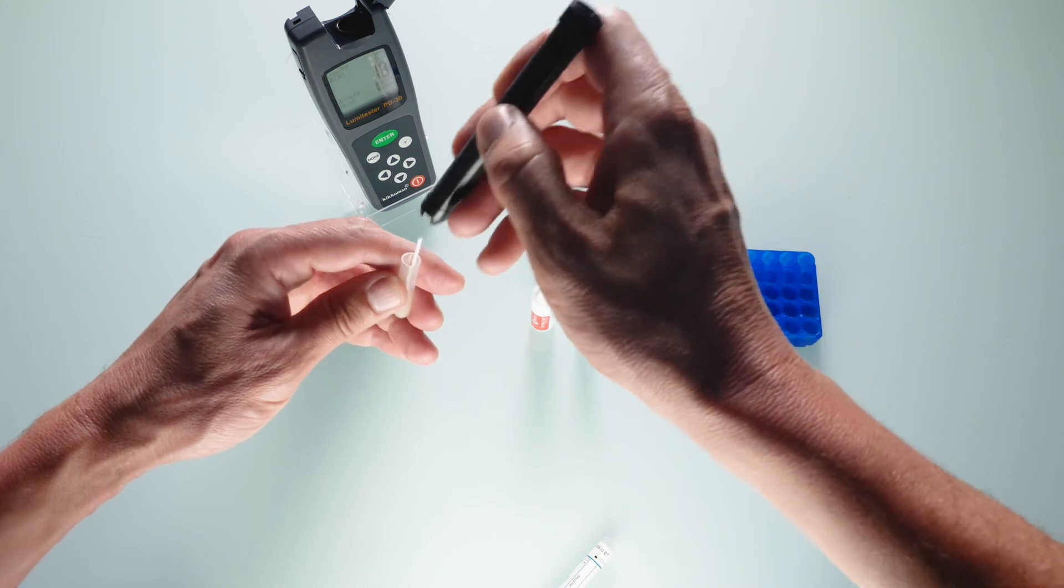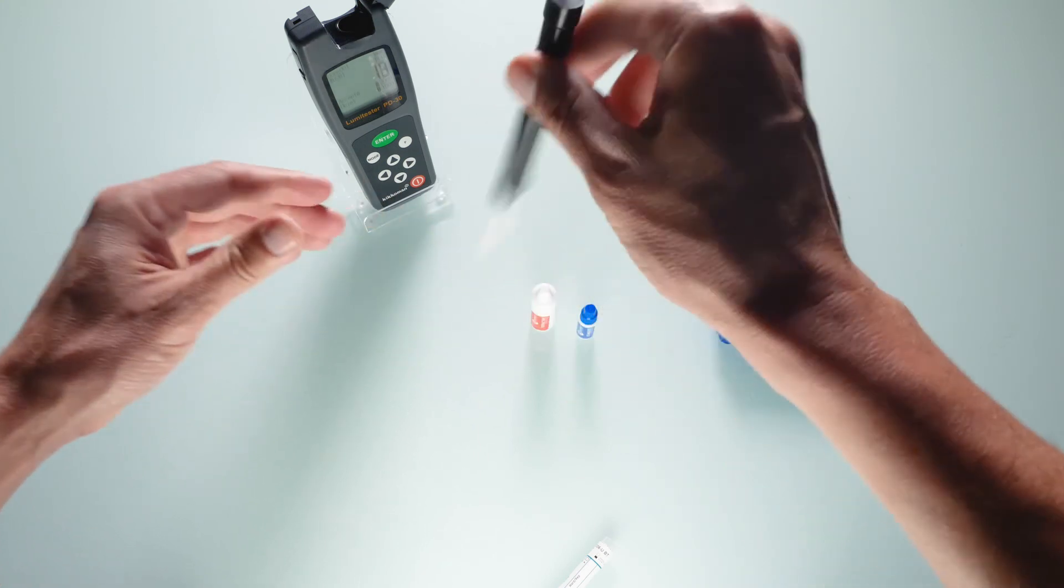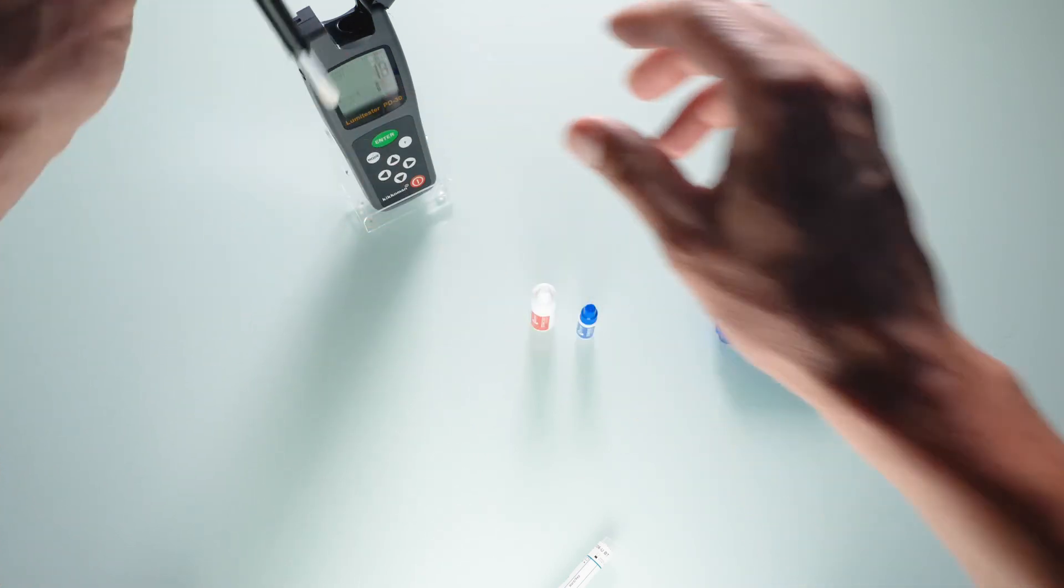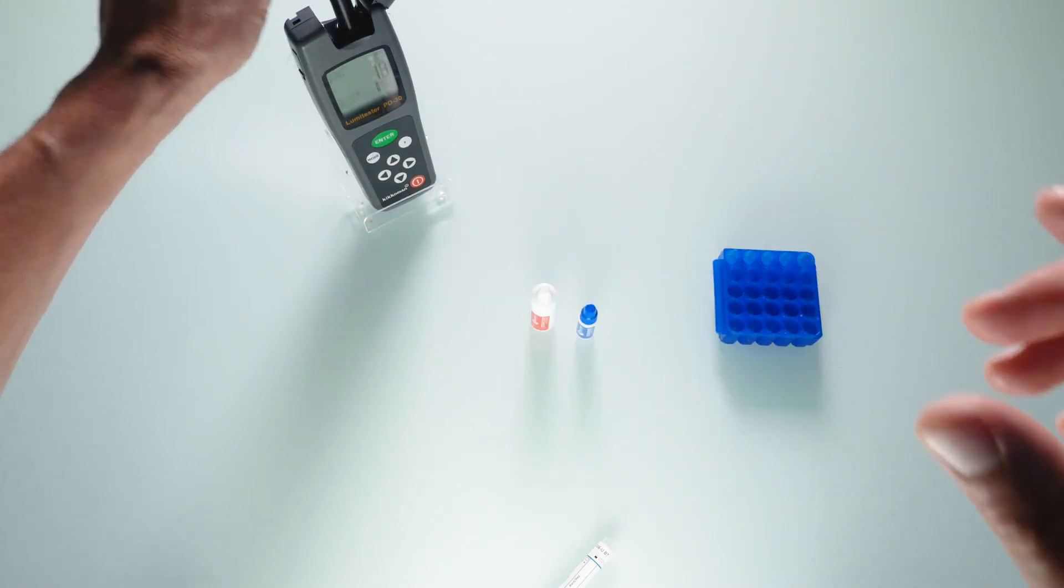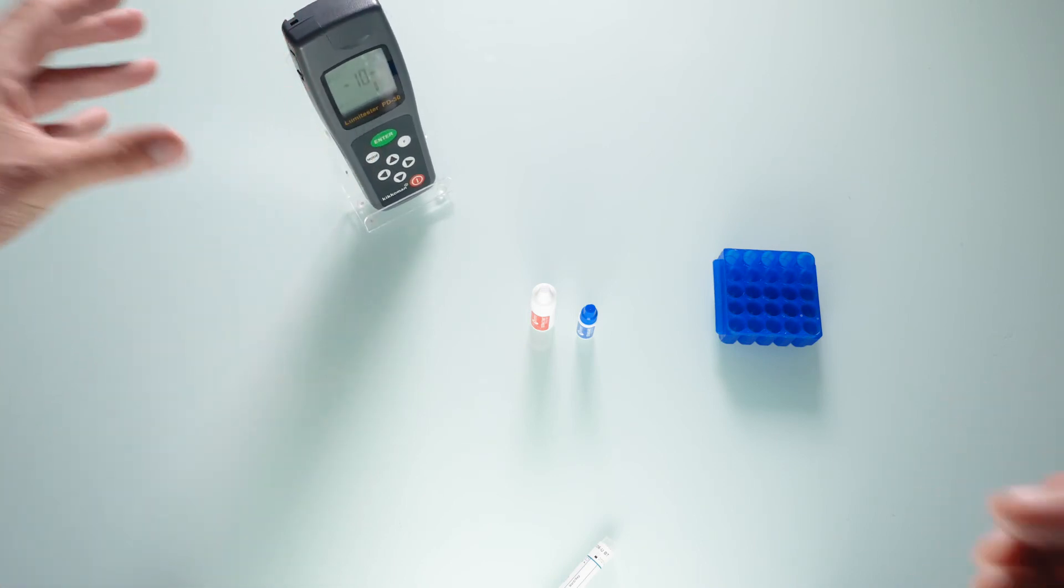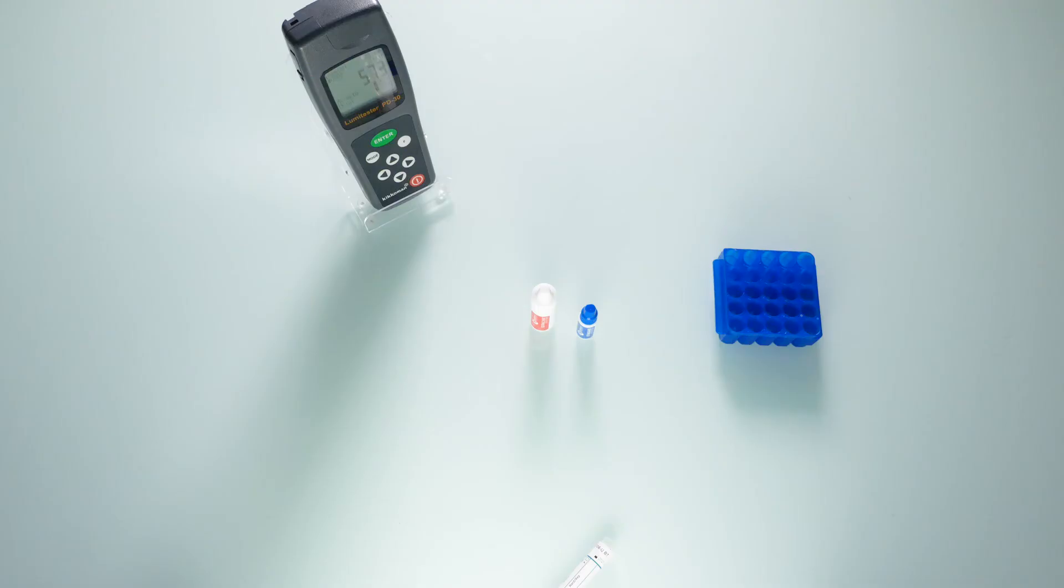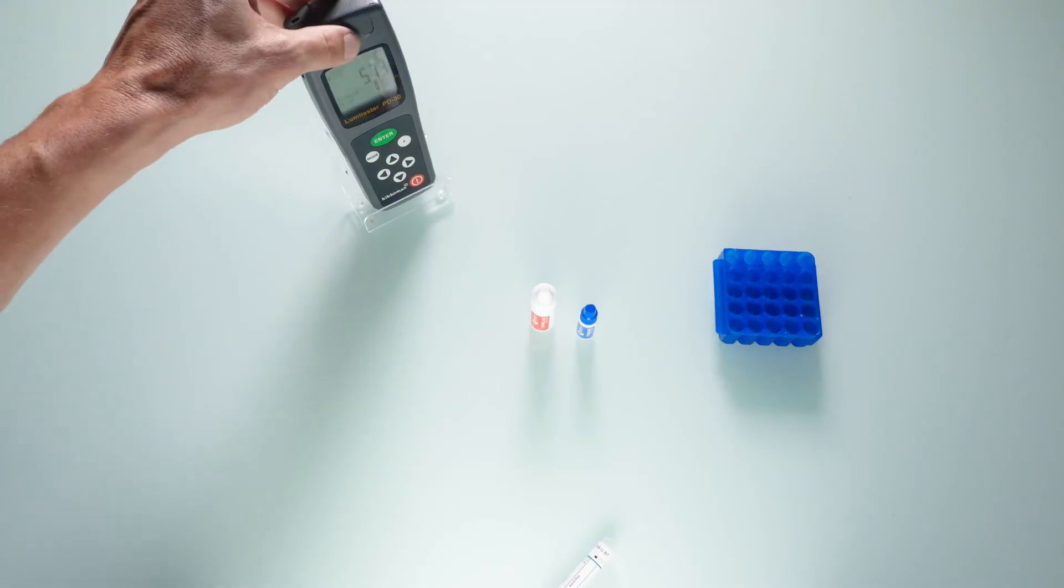Now once again clip the LumiTube onto its holder. Reinsert into the device, close the lid, and press enter. Once again the calculation will take 10 seconds and the result referred to as R2 is displayed. Note it down.